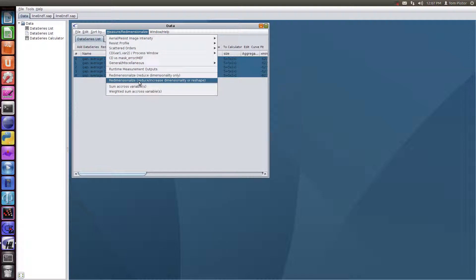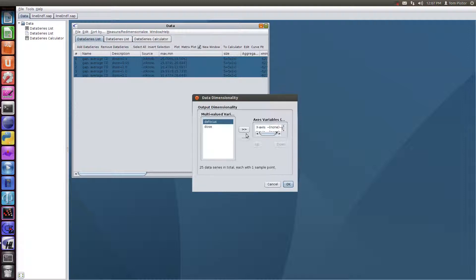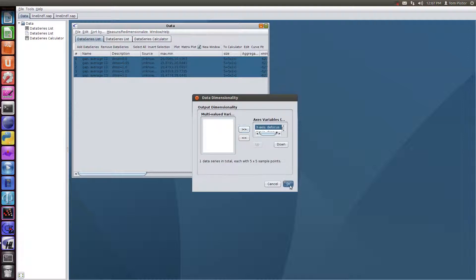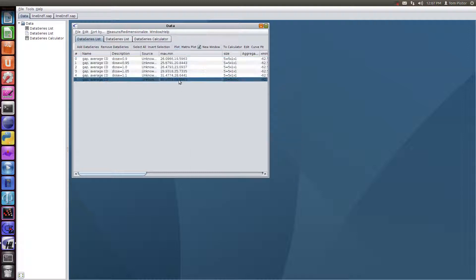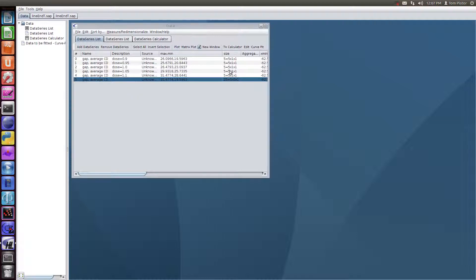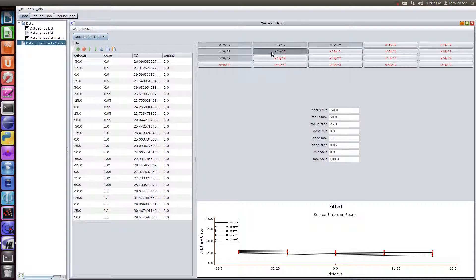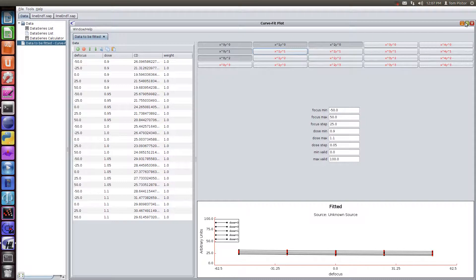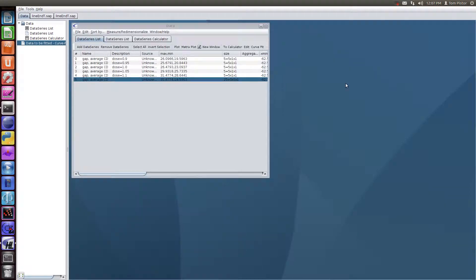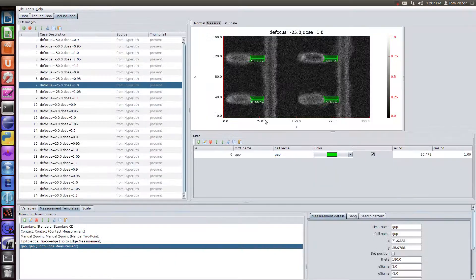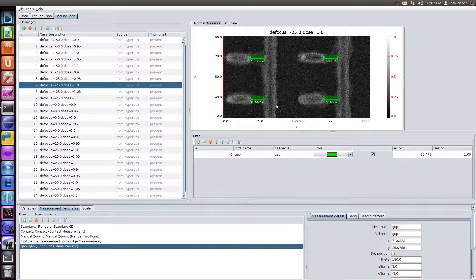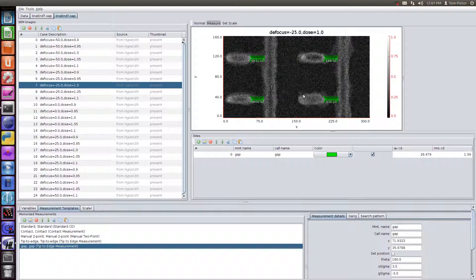Just a few steps to curve fit it. First, I have to reshape it into two dimensional data. And then send it to our curve fit. And there's our curve fit here.